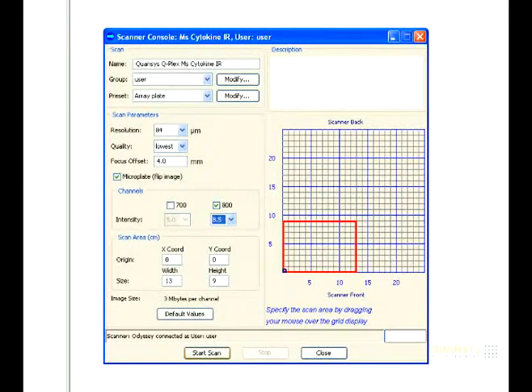If more sensitivity is needed, change the intensity setting on the software closer to 10 and re-scan the plate. If the standard curve and samples are saturated, then change the intensity setting on the software closer to 7 and re-scan the plate.